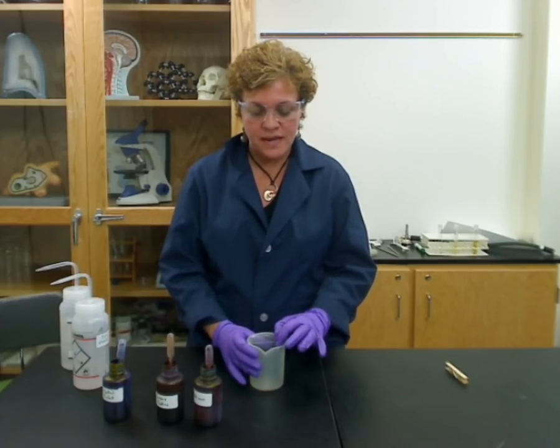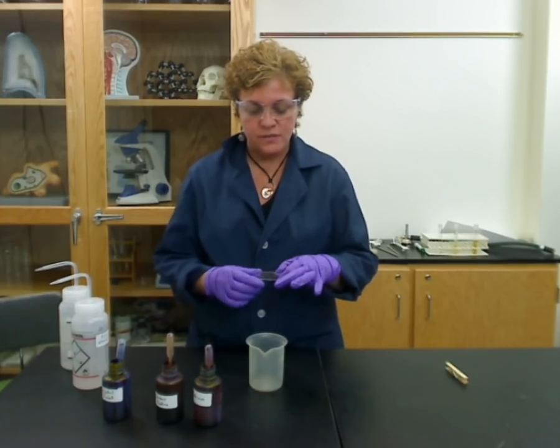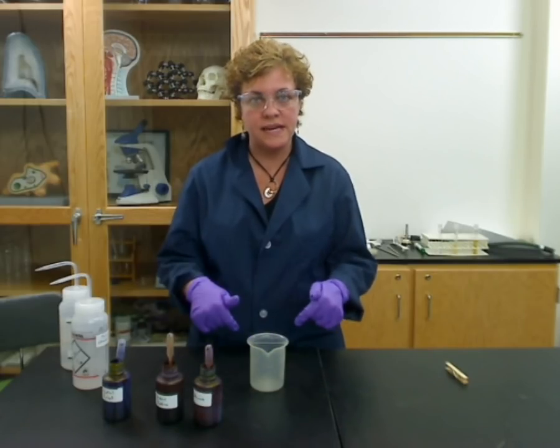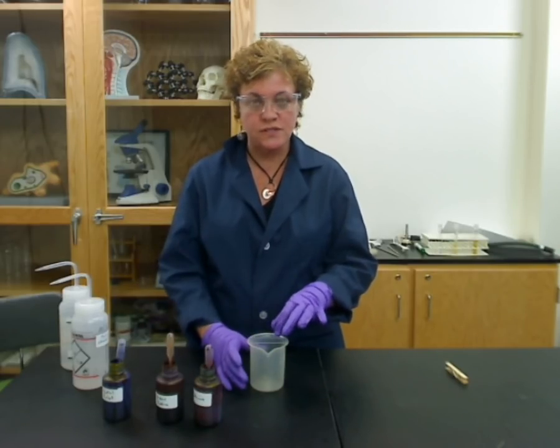I'm using a beaker. I made sure that the slide would fit on top of the beaker without it falling down, and this beaker actually works very well for this.